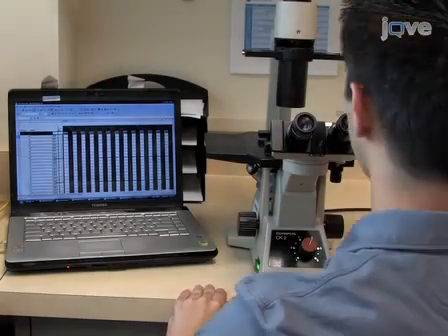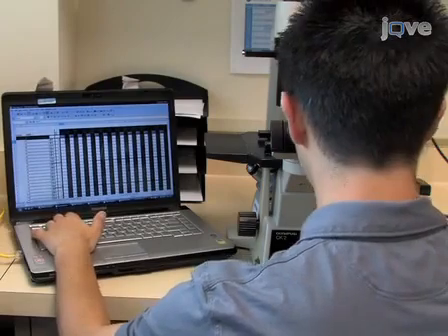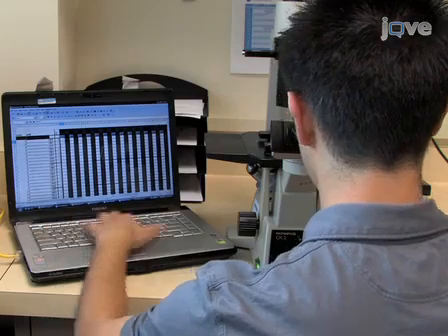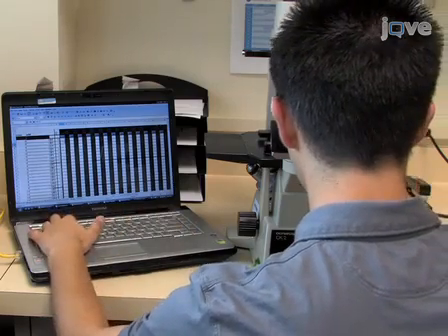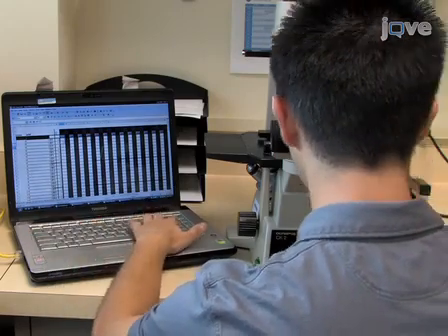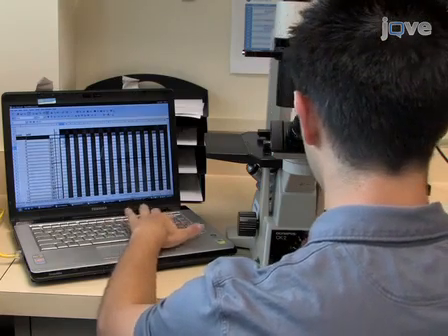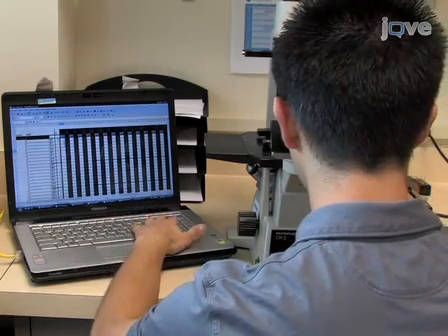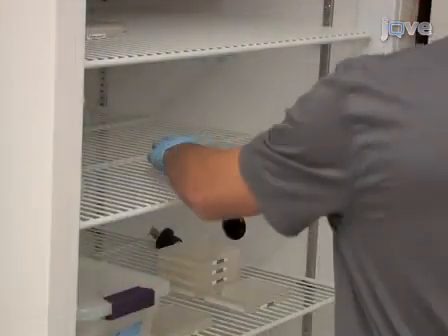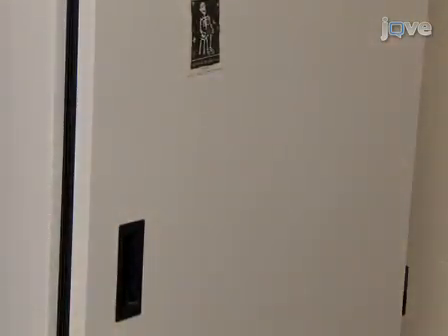In each counting session, record the date and number of animals that move as live animals. Movement in liquid is much easier than on solid media and can be induced by strong lights. The use of a higher magnification may help to spot very subtle movements, like those of the tip of the pharynx. Such subtle movements are often the only movement observed in very old animals. Return the plates to the 20°C incubator. Repeat the counting sessions every 2 to 3 days until all the animals are dead.